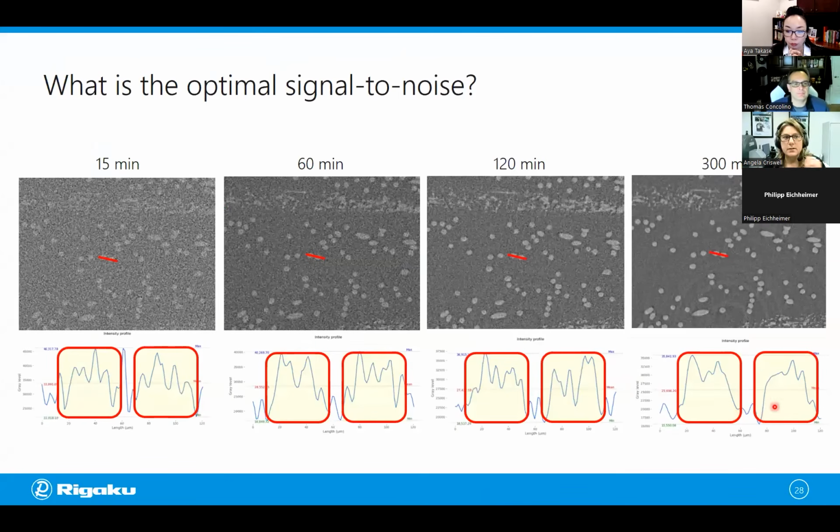Okay, here. So in this case, we're looking at an intensity profile for a single line, but in a sense, you could see where you could easily select a threshold. Even this line, if you selected it here, you would be able to isolate most of the fiber versus the background. Here, you might be more hard pressed.